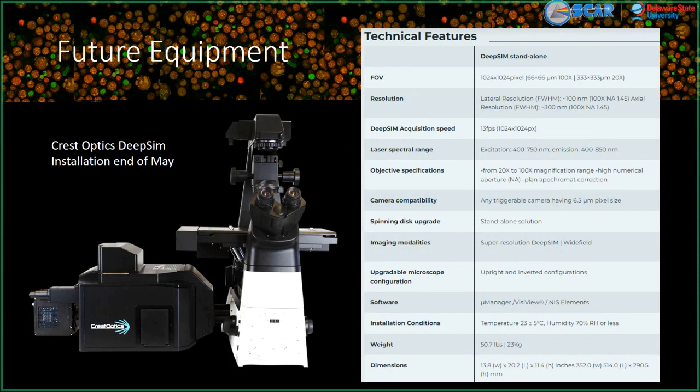And then you have another mask on the emission side. So that's the excitation side, and on the emission side, you have another group of dots that align up with that for whatever color you're working with. If it's green or red, those have to be aligned with the excitation emission source. Then these dots are modulated in a particular pattern. I don't know how they're modulated in the system because it's proprietary and part of their patent. However it's modulated, they keep track of the modulation and the rotations on these micro lenses and masks, and later you take that dot information and reconstruct it through an algorithm.